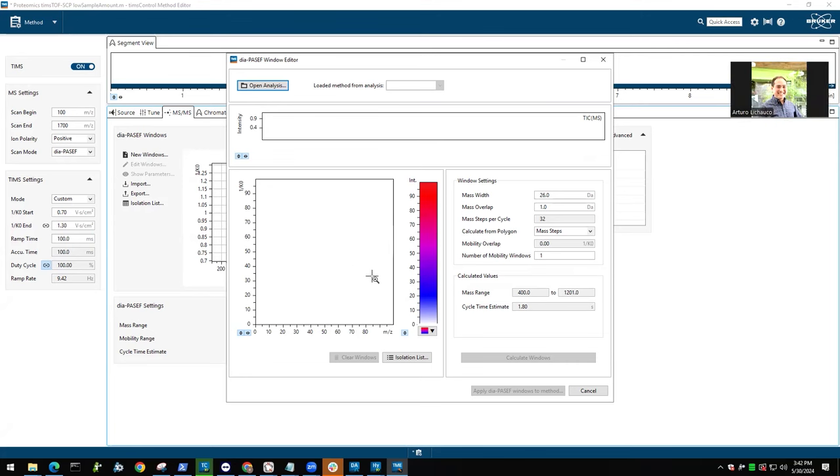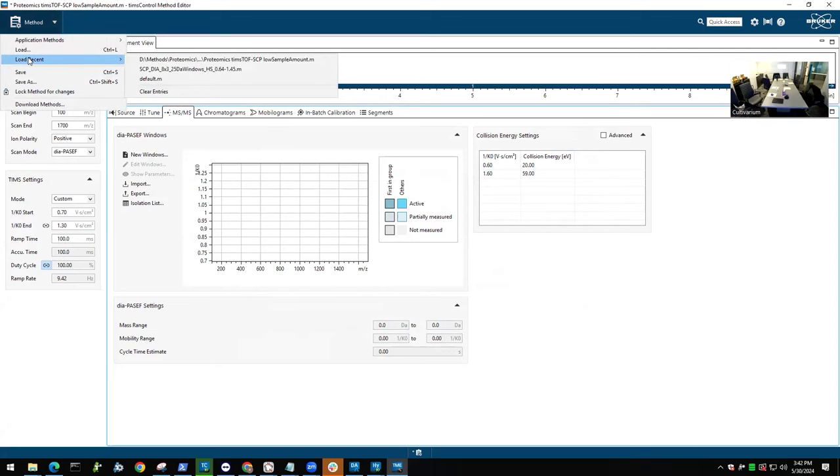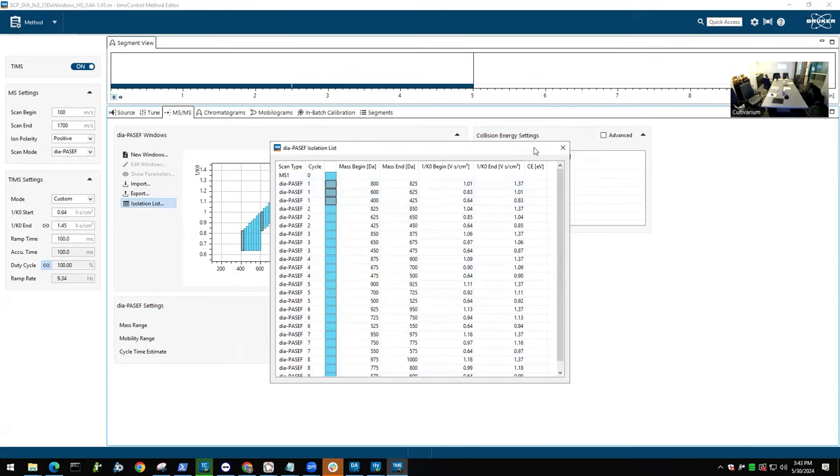So here you can basically do the drawing yourself, I just say an overlap map. It's a collection of all of the... This is really when you use some existing ones. Another. Yeah. I could even. This one, you can look at the isolation list here. But what you can also do is set the file, then get this, then read it for this one, in case you want to lower certain m/z ranges or things like this.